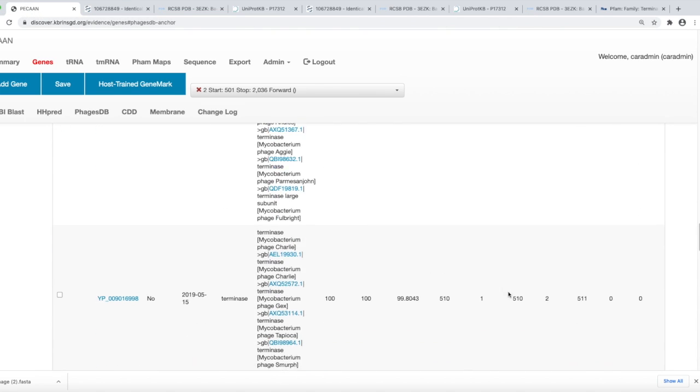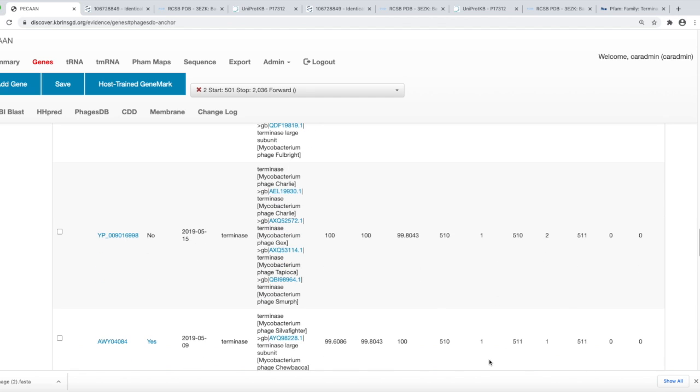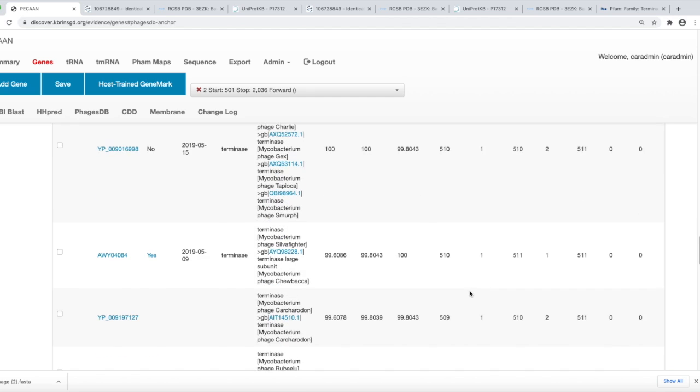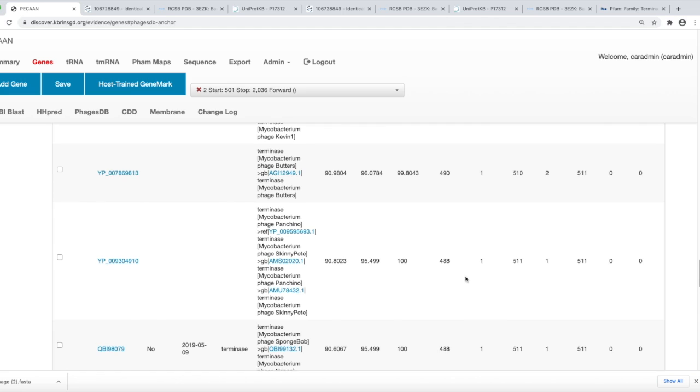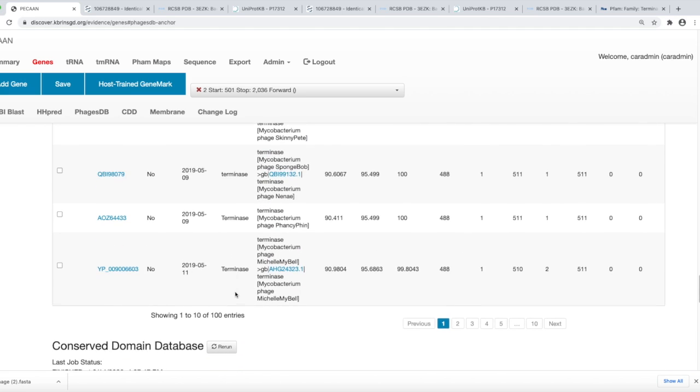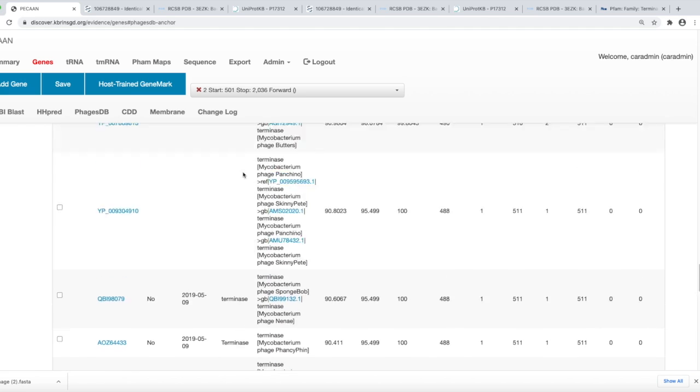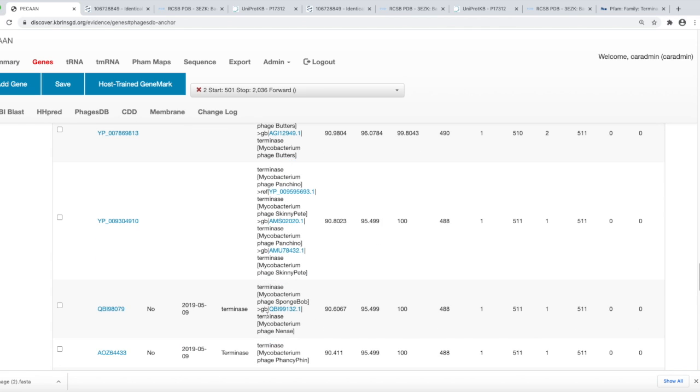Sometimes you'll find a lot of these, and you can find more structure or more functional information under the name. This is a useful type of link to be able to have in NCBI. As we look down through here, we see there's a lot of one-to-one, and so this is a lot of good supporting evidence. You see there's terminases listed even down into the 90s.